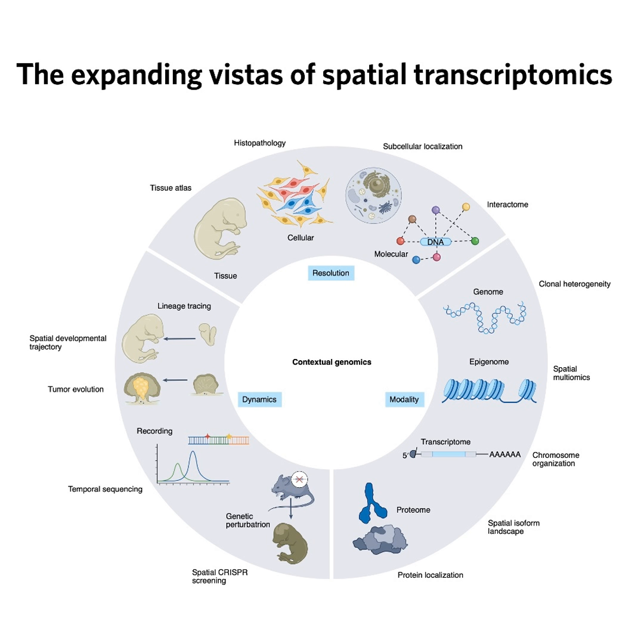The third approach is direct enzymatic sequencing. This actually tries to perform sequencing reactions, figuring out the RNA sequence base by base directly within the tissue sample. Conceptually, this is maybe the most similar to SST because it can be untargeted, potentially sequencing any RNA present.